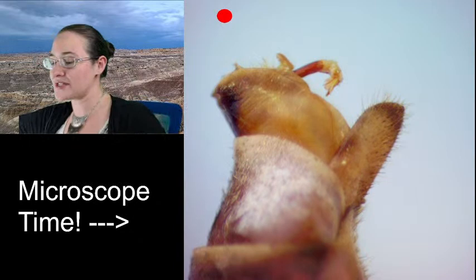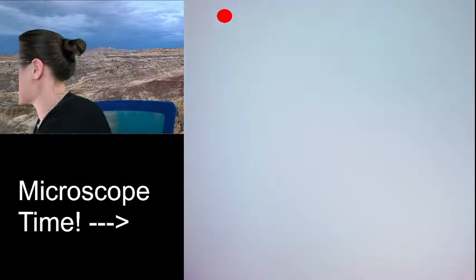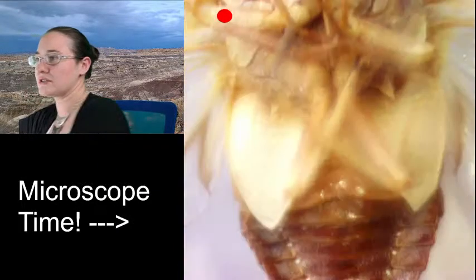Another one is going to be the timbal, where he has the ability to make the sound from. Now, that's going to be on his underside, so we actually have to flip him over and look at his ventrals. Zoom out so that you can see the whole picture.